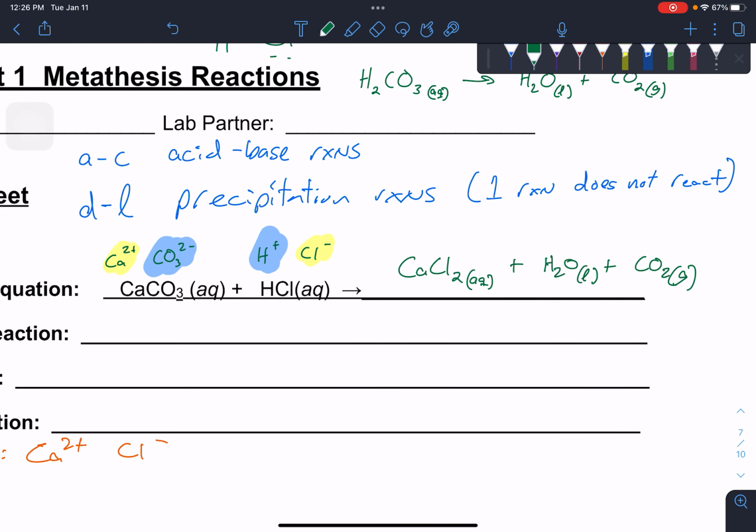If you're producing water from the reaction, does that change the water level in the beaker, or does the water that's being produced make up for the solvent that's being turned into gas? It wouldn't be that noticeable. I think the volume probably doesn't change all that much, is my guess. Because it originally started as matter occupying space. The CO2 bubbling off, there could be a little bit of a drop. It definitely loses mass, of course, for the CO2. How that affects the volume, I don't know.